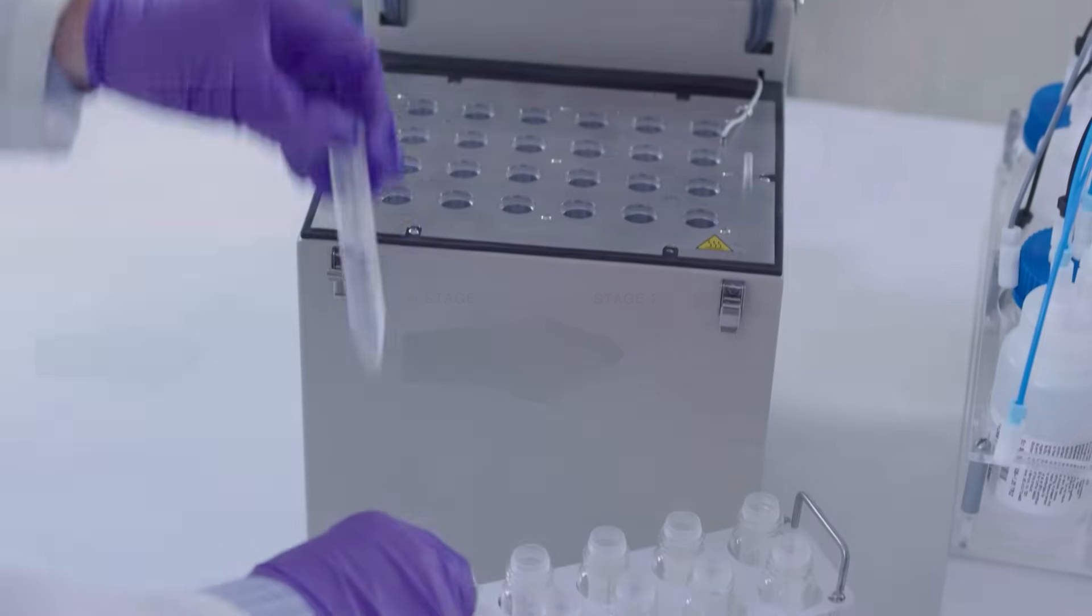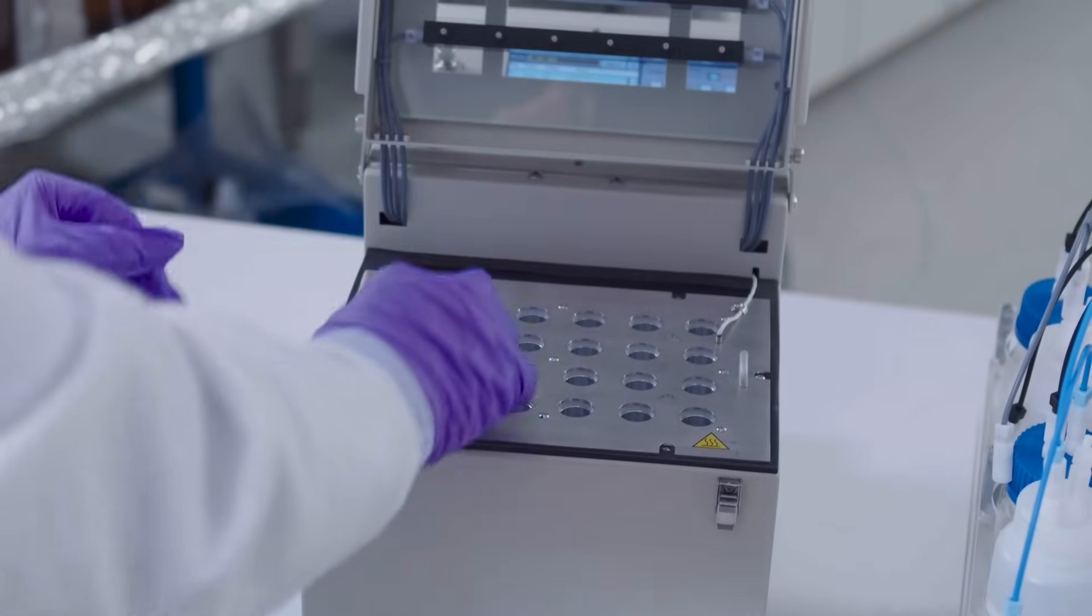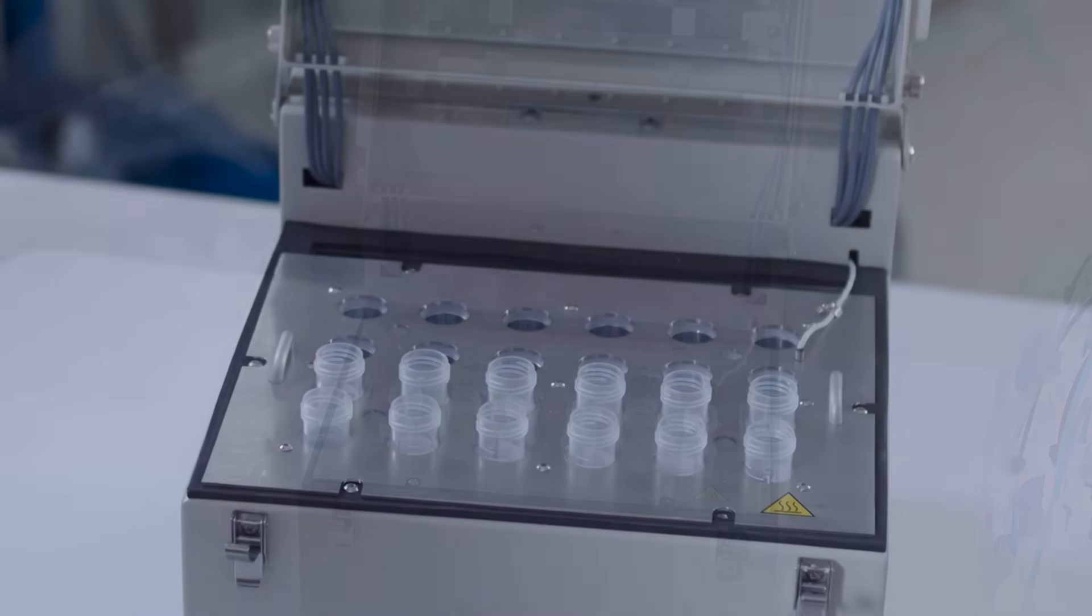Small number of components to clean. Minimize manual steps to lessen error and maximize limited man hours.